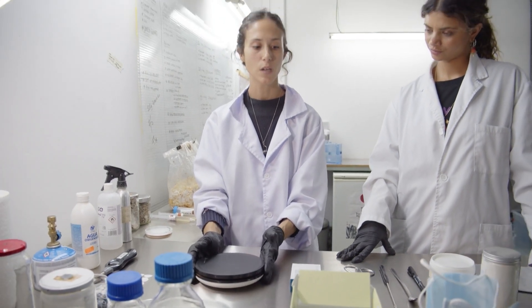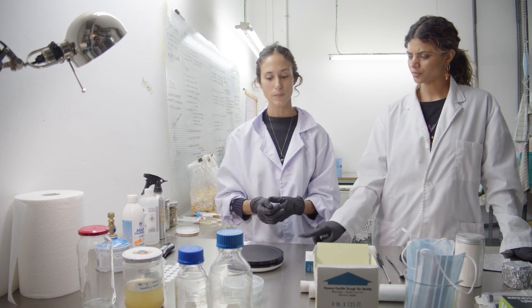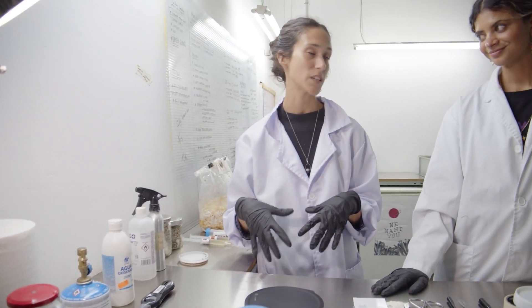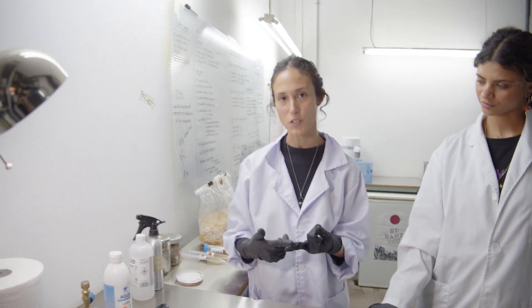We use a scale for measuring substrate weight and the weight of various nutrients and additives in our material mix. It's best if the scale goes to 0.1 grams. We don't have a laminar flow hood in this lab space — and you don't need one either. They can be pricey, but it's an amazing tool if you have the means. It's a HEPA filter that blows clean air into your work surface to minimize contamination risk.